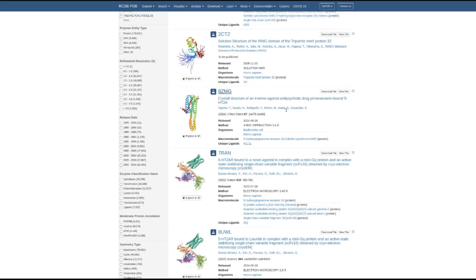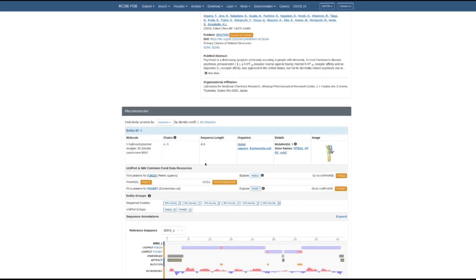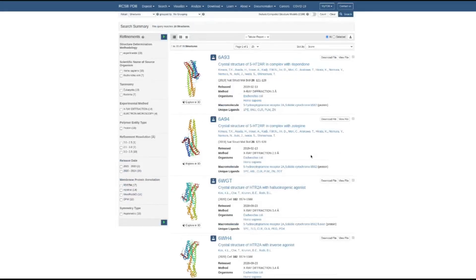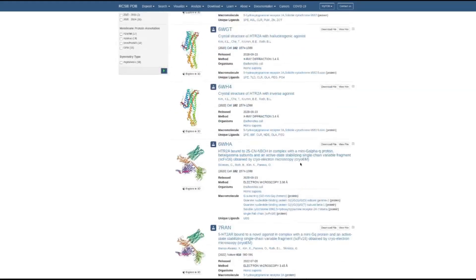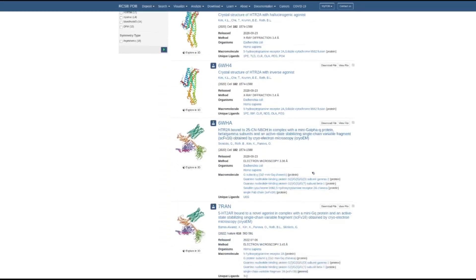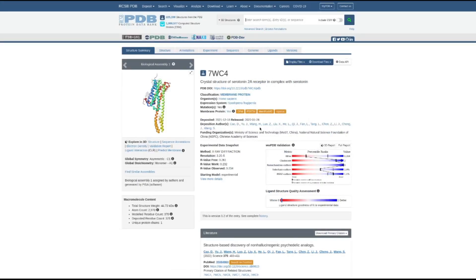Here we can see the 5-HT2A receptor — in this case with inverse agonist pimavanserin bound to the active site. If we don't want this drug bound to the active site, we can go down and look at the specific protein, which is P28223, and see all of the crystal structures obtained for this receptor bound with various molecules. We'll look for the one with serotonin, 7WC4, and that's the receptor and bound molecule we'd like to use, so go ahead and click download in PDB format.